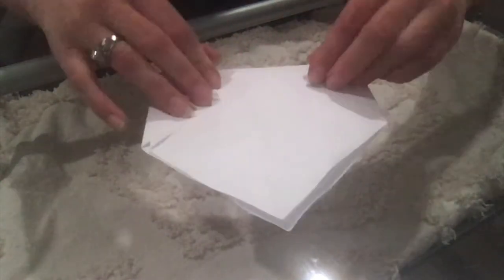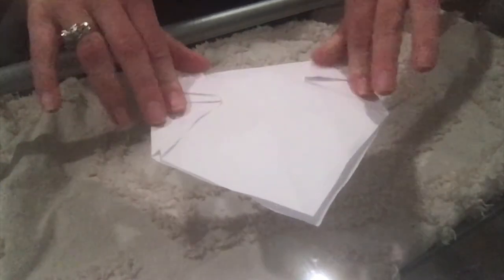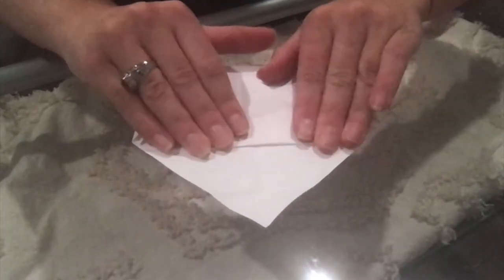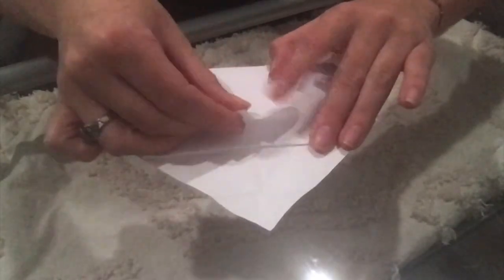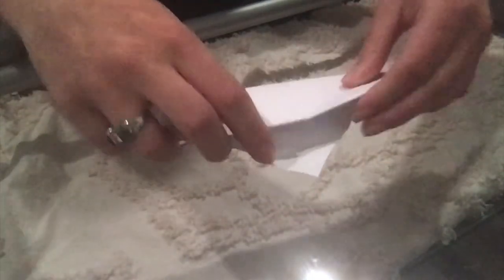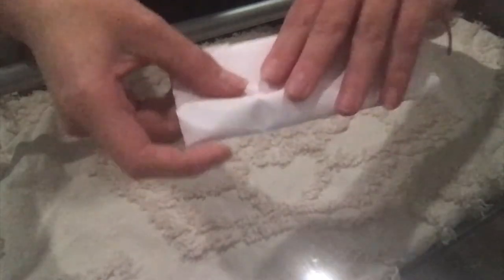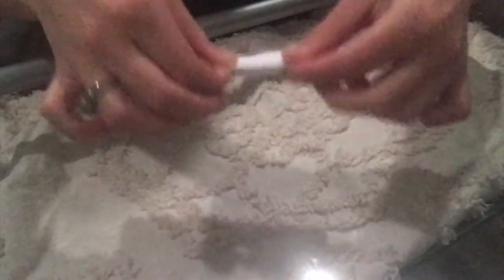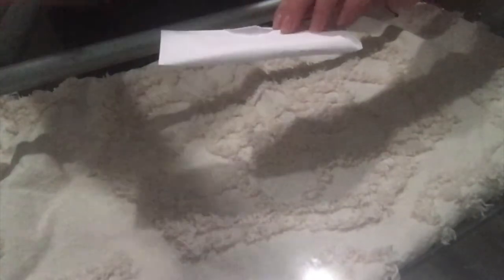We're repeating the same process — I've done my doggy earrings, now I'm doing it on the top as well. Then fold it in and make it look like an envelope, just like before. That is basically how you autoclave wrap.